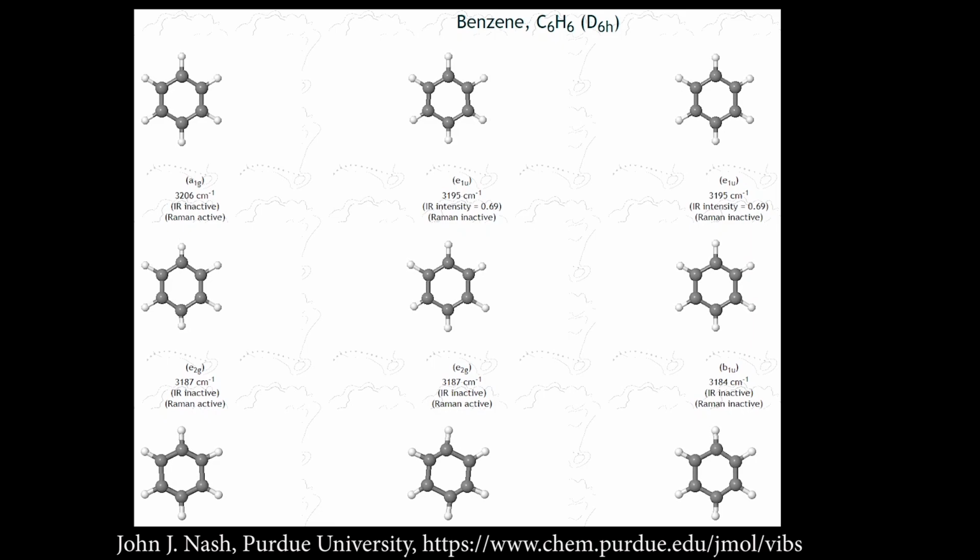What you're watching is, I've put in a photon with an energy that happens to match this particular bond vibration or this particular bond movement, and that excites it. That light gets absorbed and goes missing, and that's read as absorbance in the IR spectrum.